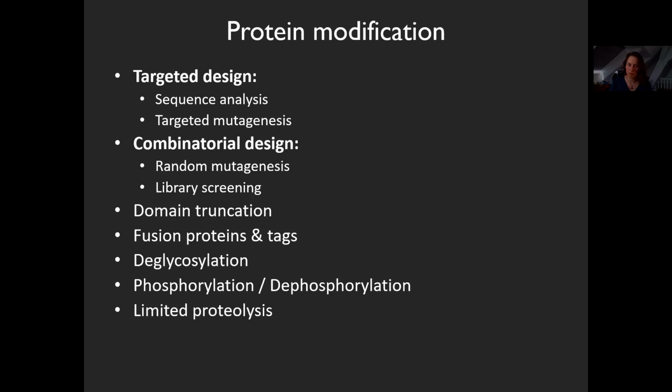And they diffracted to 1.6 angstrom. We could never do it again. We only had that one drop and the 3 crystals that were in there. And we think that mold may have eaten either rests of glycosylation or the protein. That's not exactly what most people use in the lab for limited proteolysis. You possibly want to use a kit from a major company. But it can happen.